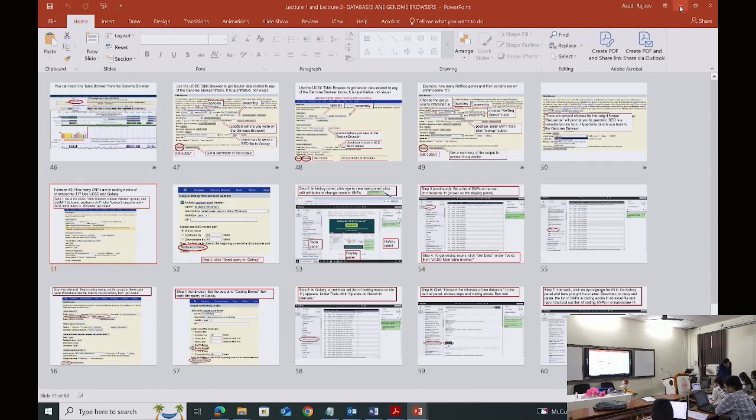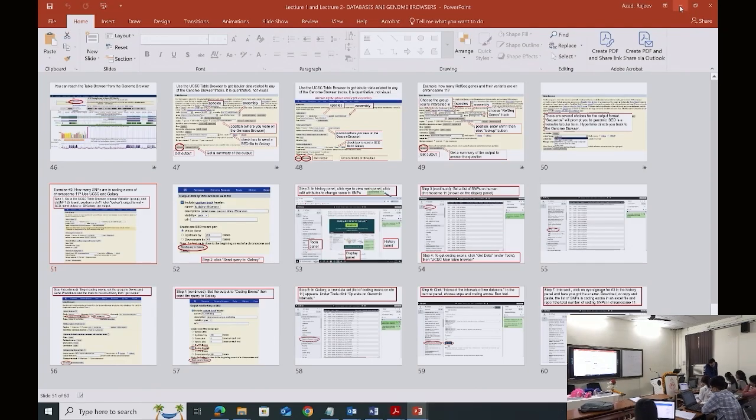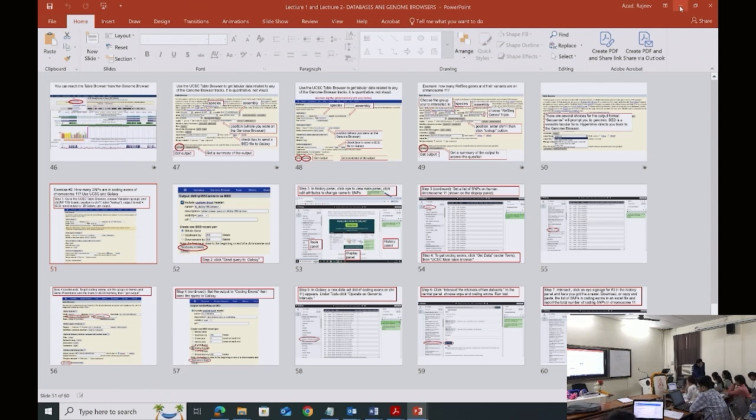So GTC 1, 2, 3, 4, 5. Valine, alanine, valine. Okay. So I don't know actually, but I will trust that this is correct. Okay. So same. Oh, so this validates. Okay. Good.